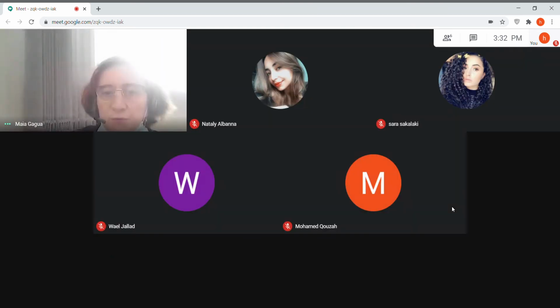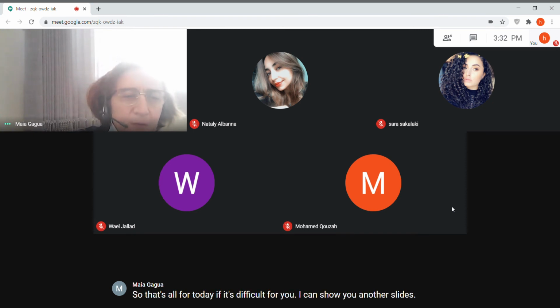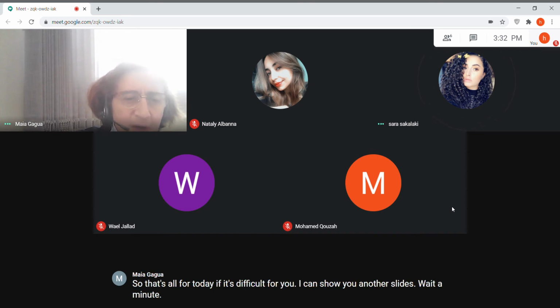So that's all for today. If it's difficult for you, I can show you other slides. Wait a minute. I will find slides with Georgian titles.